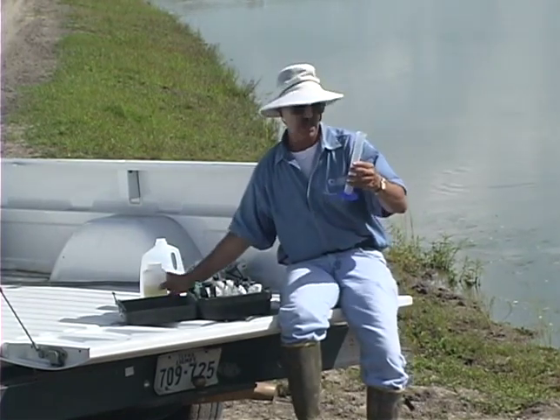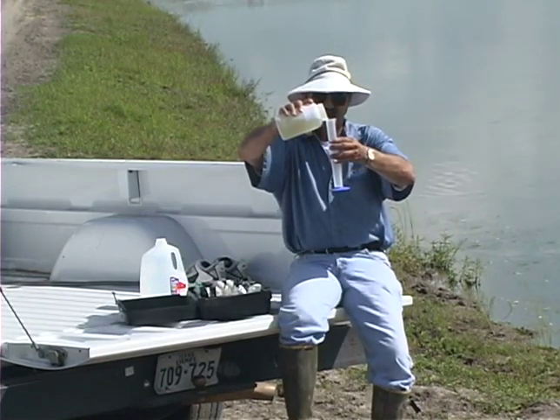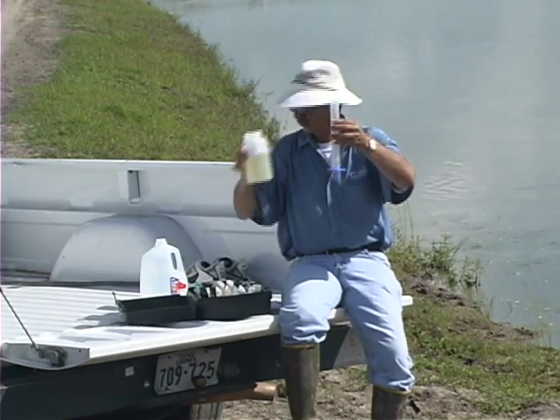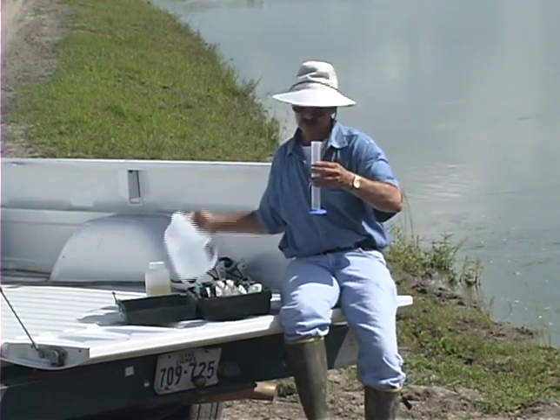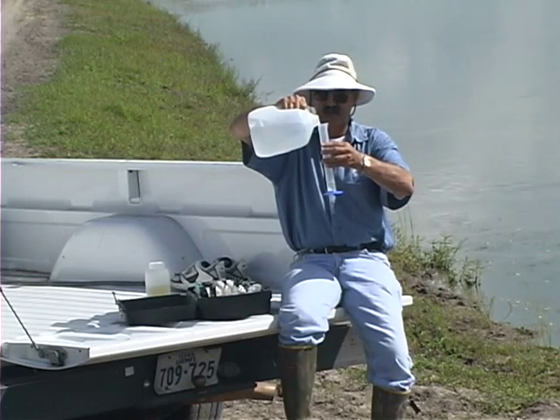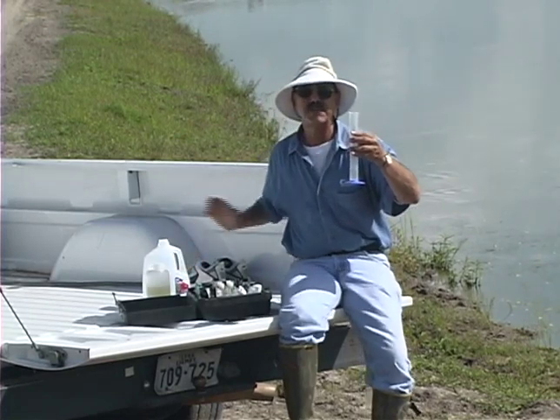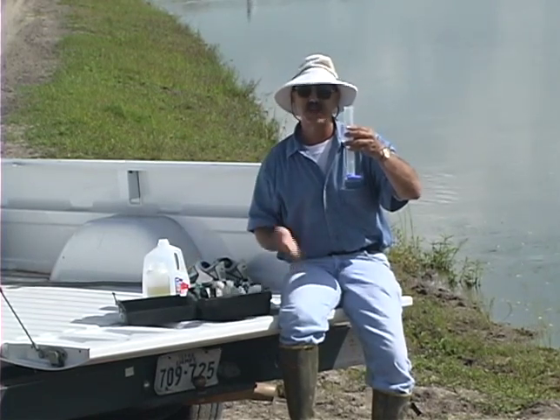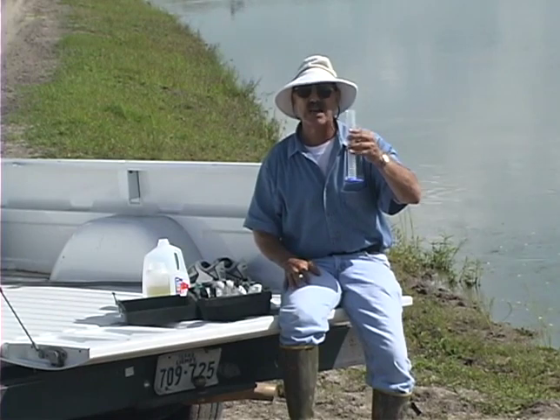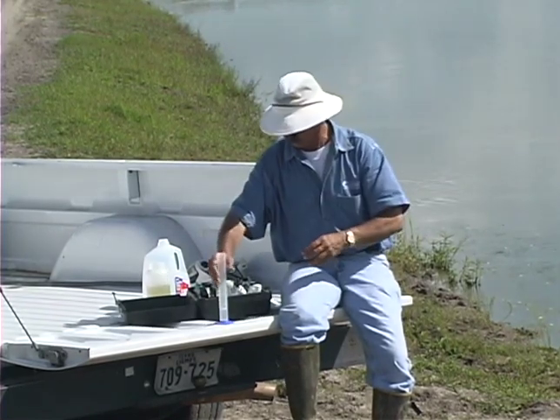To do this, we're going to start with a 10 milliliter sample of our pond water and 10 milliliters of distilled water, which will give us a 50-50 mixture, which should in effect lower the ammonia by 50% and thus allow us to test this water.